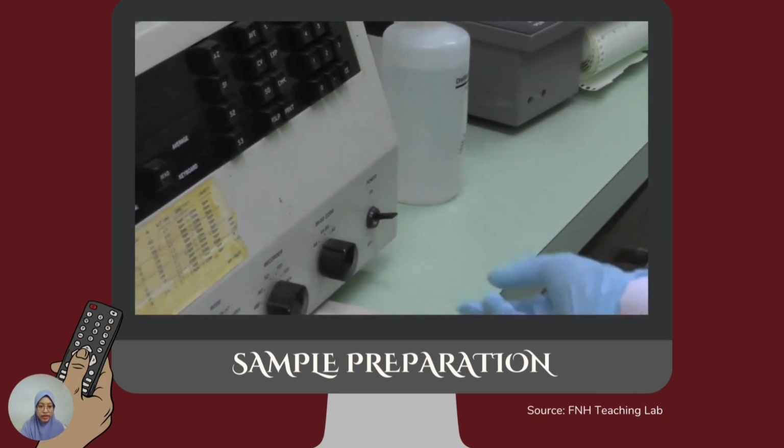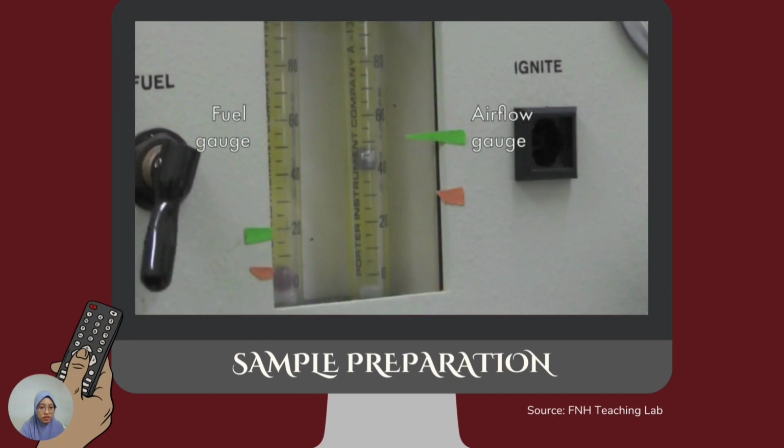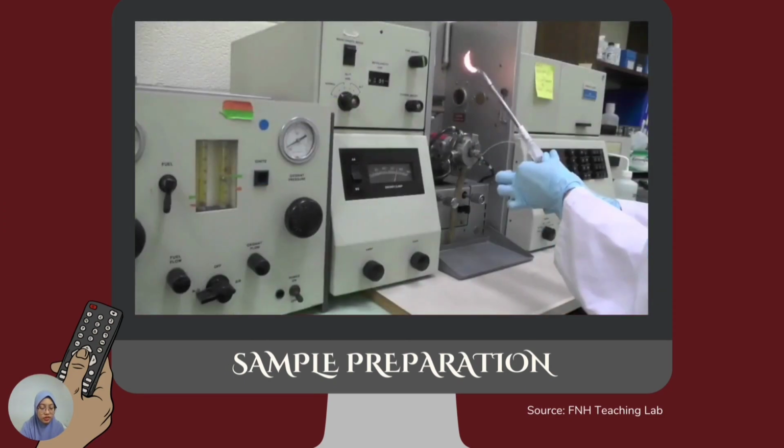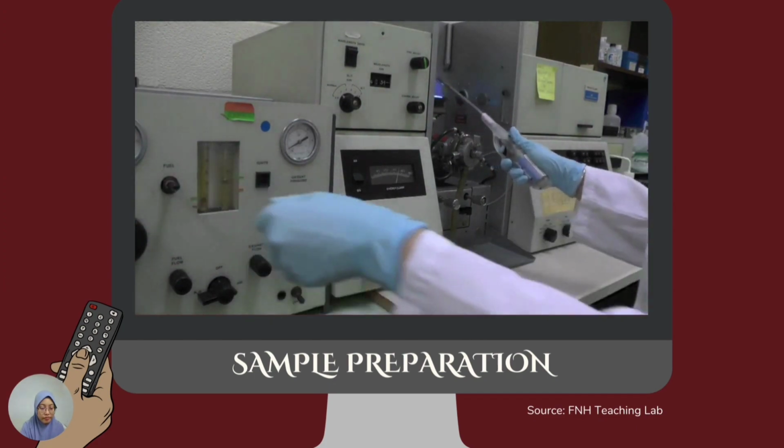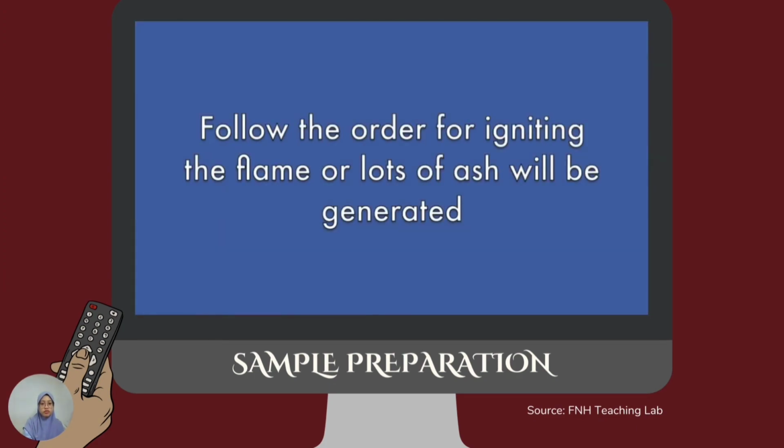Turn on the power switch of the instrument. Then turn on the acetylene gas tank. Next, turn on the airflow. Adjust the airflow and fuel to the appropriate level. Turn the control to air while lighting the flame with the lighter. Turn the fuel to the on position. You should observe a nice blue flame about 2 inches tall. Please note that it is important to follow the proper order to ignite the flame, or you will create a lot of ashes but fail to ignite the flame.